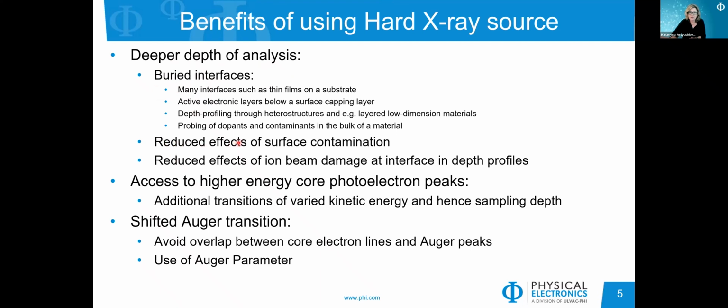Another very attractive advantage is the reduced effect of surface contamination, and I will show an example of that, and reduced effect of ion beam damage at the interface. And I will show you some of the results of that effect as well.